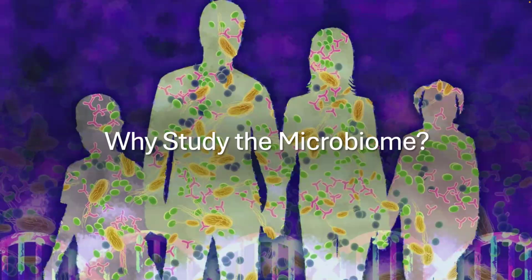Before we dive into the analysis, let's first discuss why microbiome research is important and how we collect and process microbiome data, and what you will learn in this training. Microbiomes are microbial communities that play essential roles in human health, environmental ecosystems, and disease. Microbiomes exist in many forms, but we'll focus on the gut microbiome in this module. However, the techniques you will be taught apply to all microbiome studies.